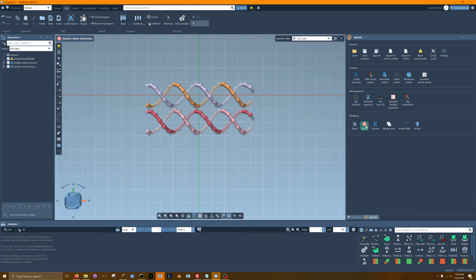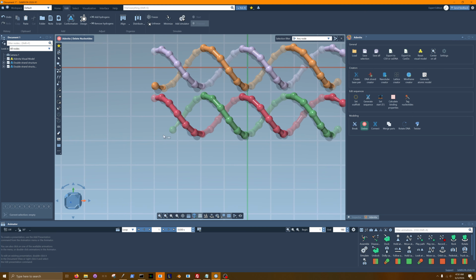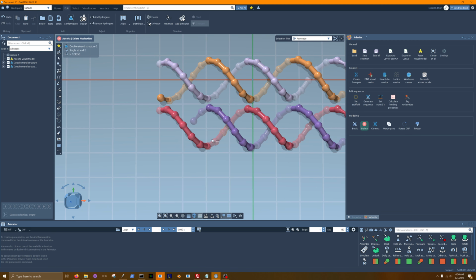Let me use the delete command, and on the 3' end, let's trim back 4 nucleotides, like that. And that makes our extended sticky end, right, like that. So do up here as well. There we go.